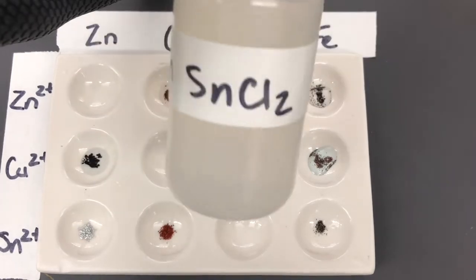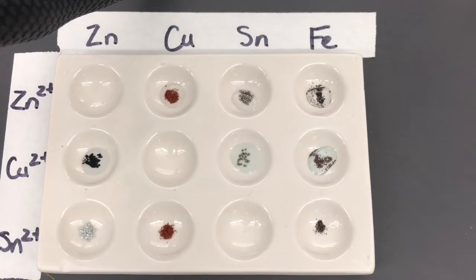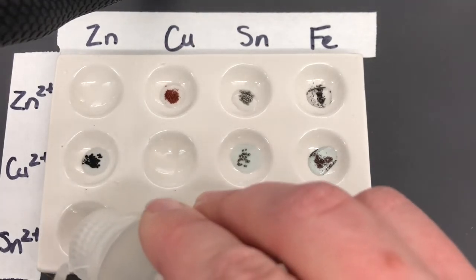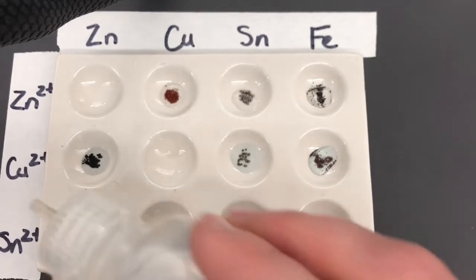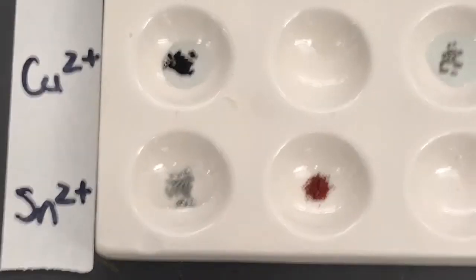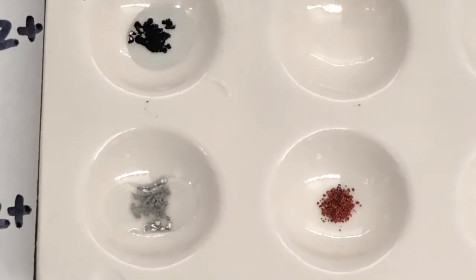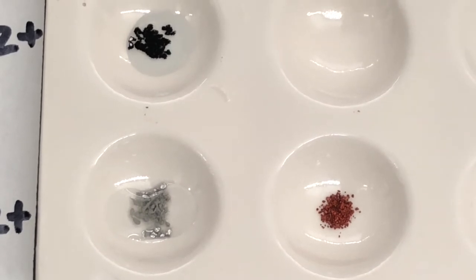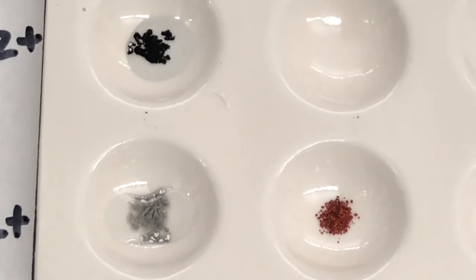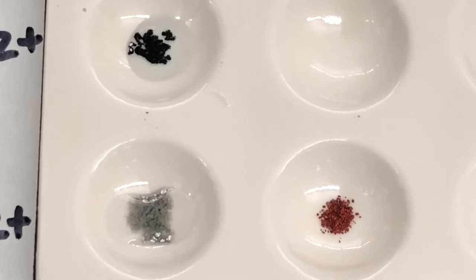We're going to have a 0.1 molar tin 2 chloride added to each of these metals. So I started by adding some tin 2 plus to the zinc, and as we zoom in, you'll see anywhere where the solution is on top of the metal zinc that it's starting to form this gray precipitate. You also see a bit of bubbling happening.